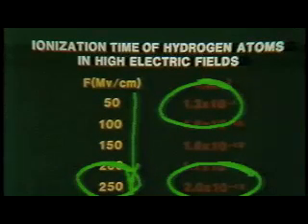And that meant that if you could create a very high field strength in some way, ionize these particular species, do that near the surface of a sphere, and allow those ions to travel into space, one could get an image formed by those positive ions. Now, of course, it's a very difficult problem in practice to create very high electric fields.